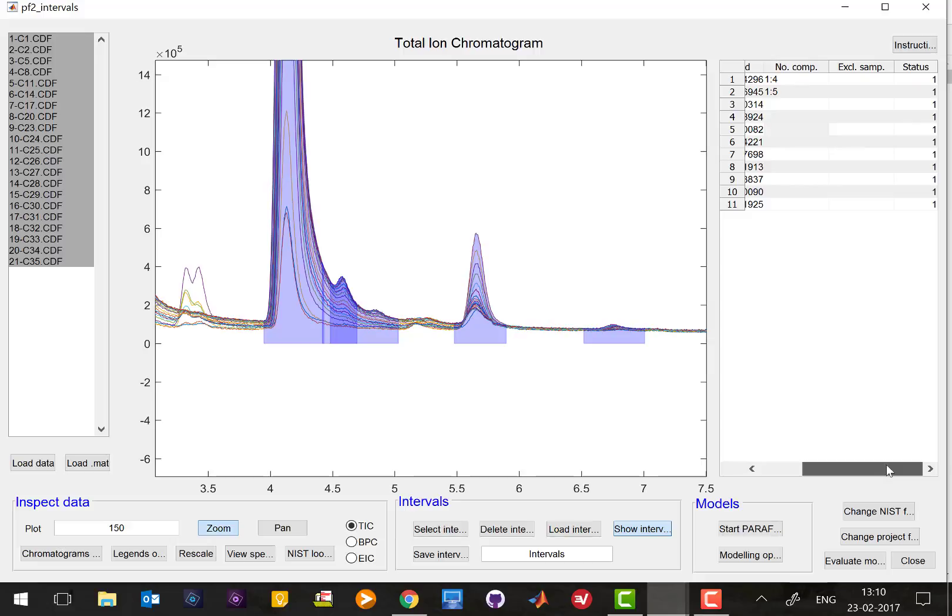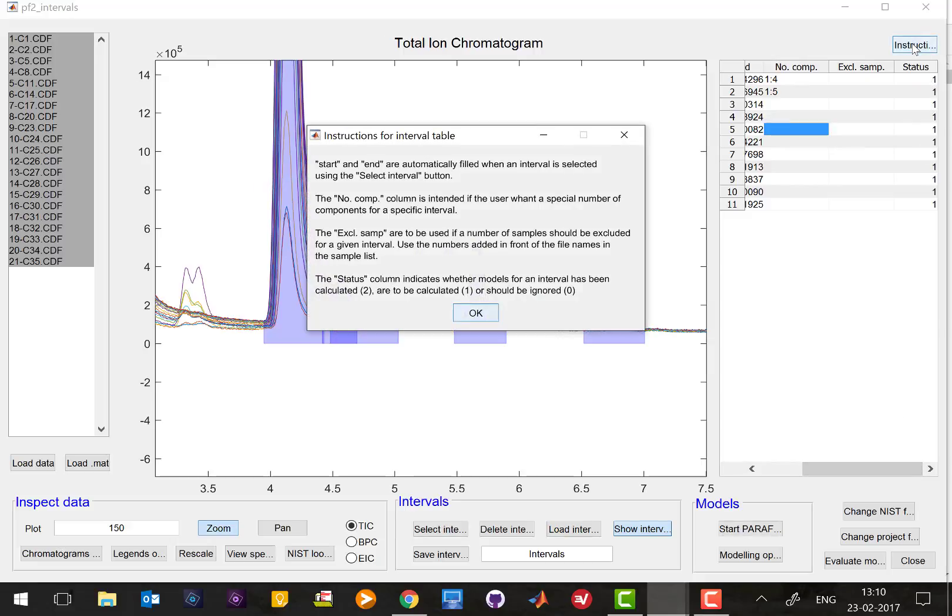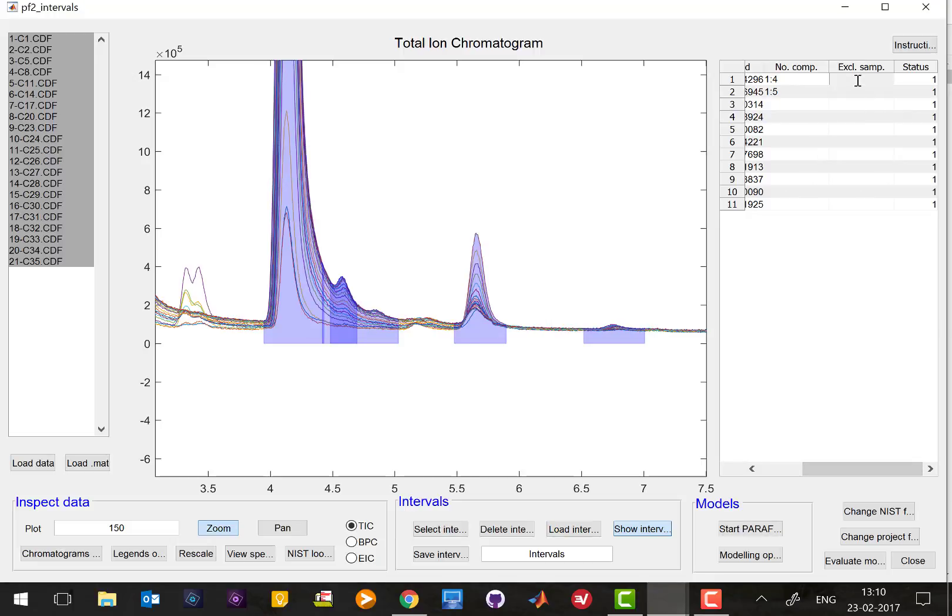And sometimes you don't want to include all the intervals in the model so if there is any sample that you don't want to include you can actually write the sample number, let's say for this interval I don't want sample one, for this interval I don't want sample two.